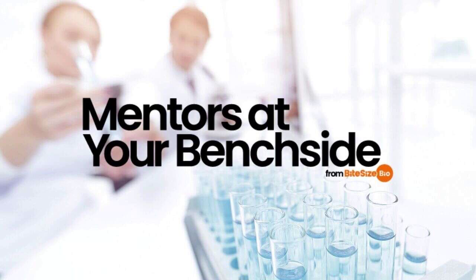Tip 2. Avoid static electricity. After weighing, samples should not be stored in plastic containers, and if possible, conduct weighing operations while standing on anti-static flooring. You can also buy anti-static weigh boats and try discharging any static built up in your clothing by touching something conductive. But beware, this might give you a tiny electric shock on your fingertips.